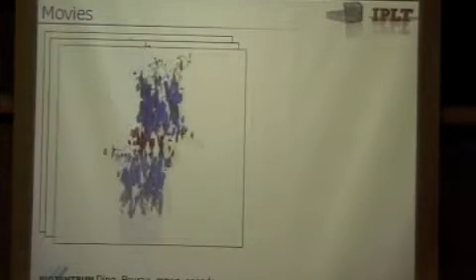Okay. And there's one last possibility that you can do. Instead of looking at static pictures, you assemble them into a movie. So you basically make different images from different sides of your protein. You can do this with the same tools, Dino and PyMOL, or whatever you want, and just save them.